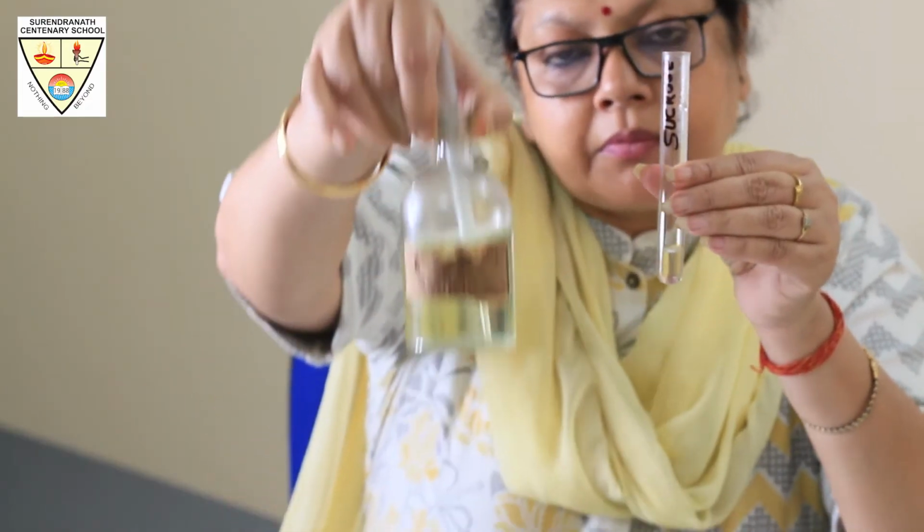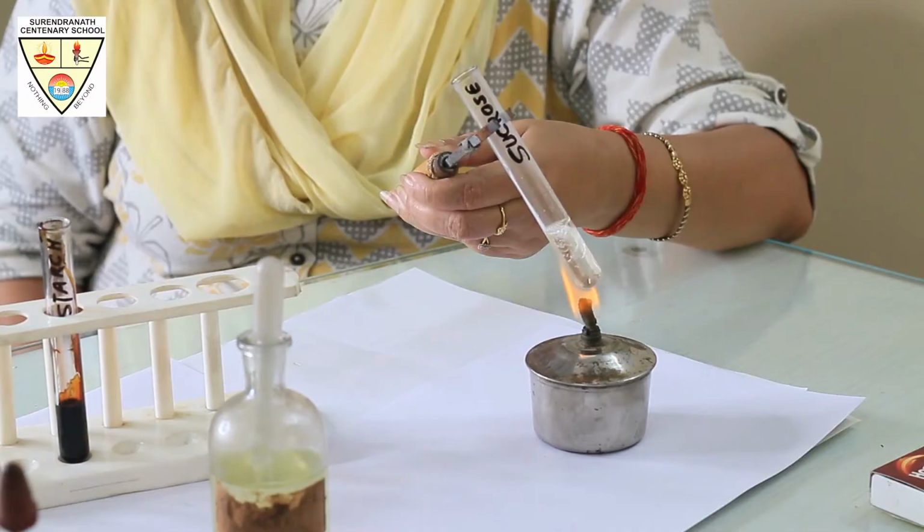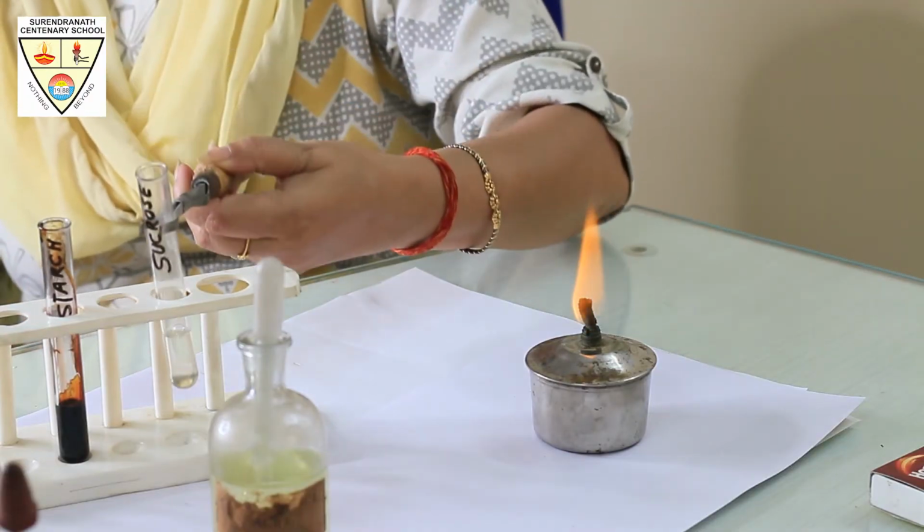Next, we are going to talk about disaccharides. Take 2 milliliter of sucrose solution in a test tube, add HCl to it and gently boil it for some time.